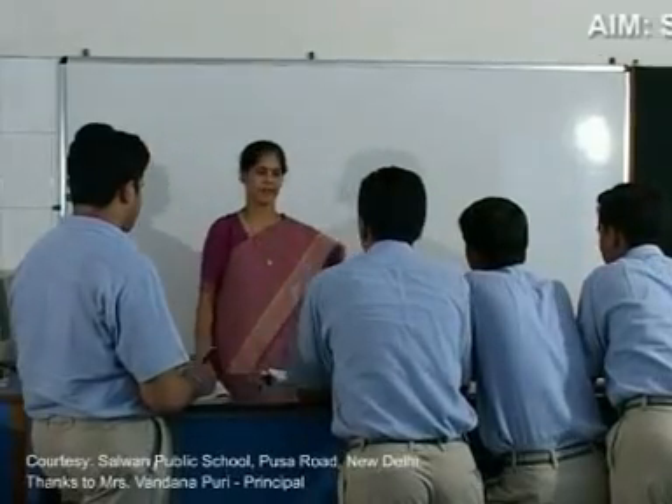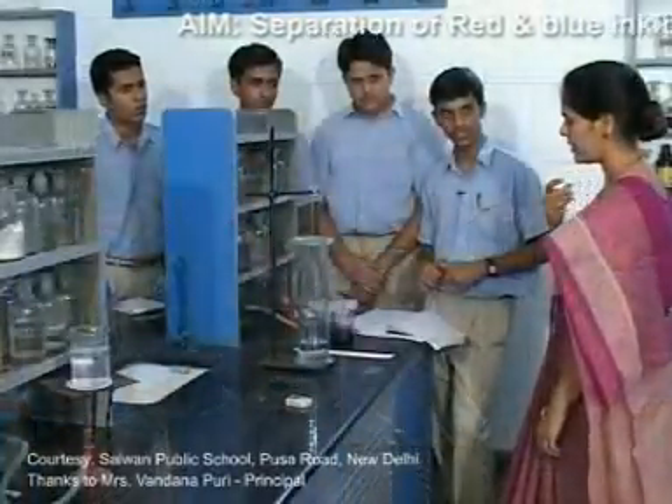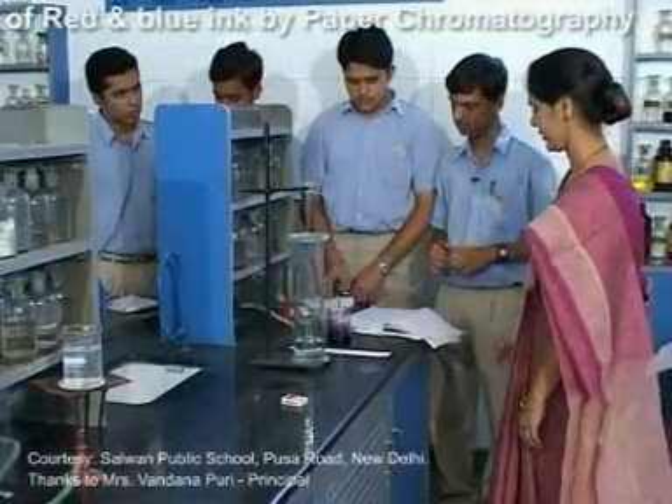Today we will perform an experiment based on chromatography. Now let's start with the first point, which is the spotting.